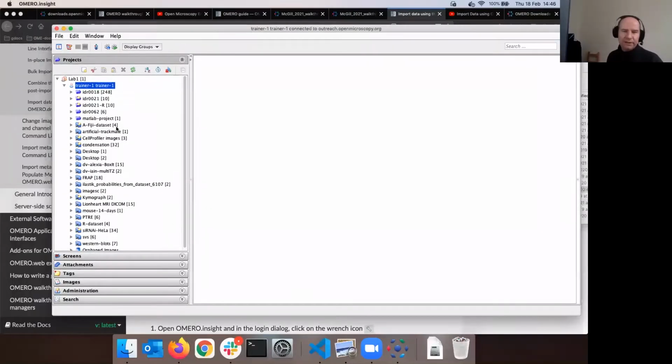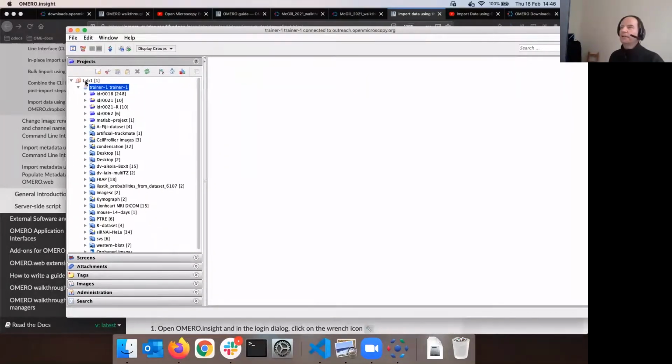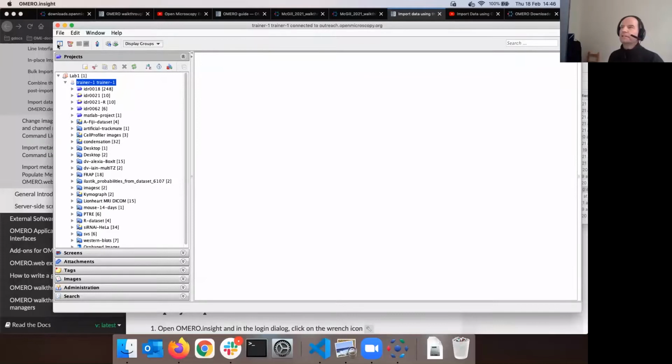So, still struggling? I will now go and tell you about the import steps themselves.